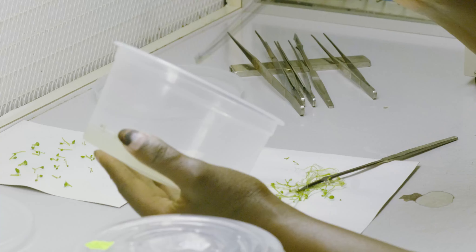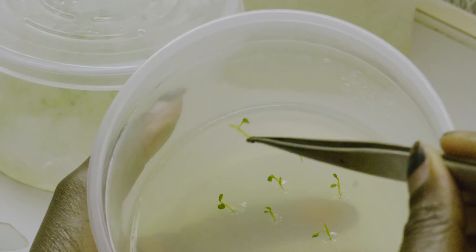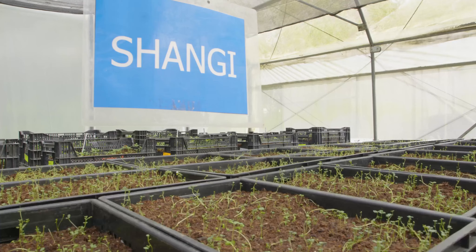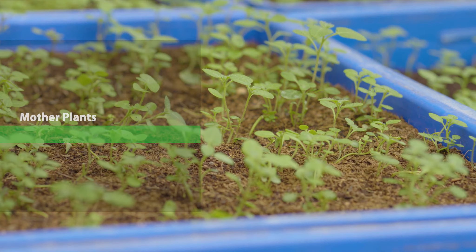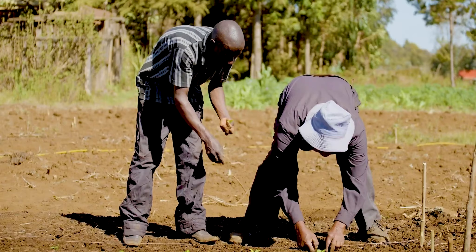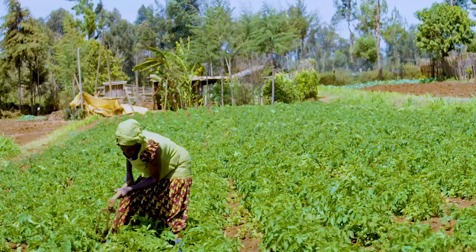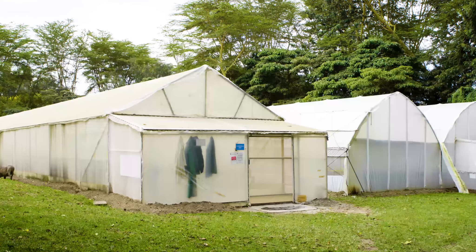Cuttings are produced in several stages. First is the production of tissue culture plantlets. In the next stage, tissue culture plantlets are grown, maintained, and multiplied to increase the pool of mother plants from which the cuttings are produced. Once rooted cuttings are transplanted in the field, they produce tubers for further multiplication into commercial seed for farmers.